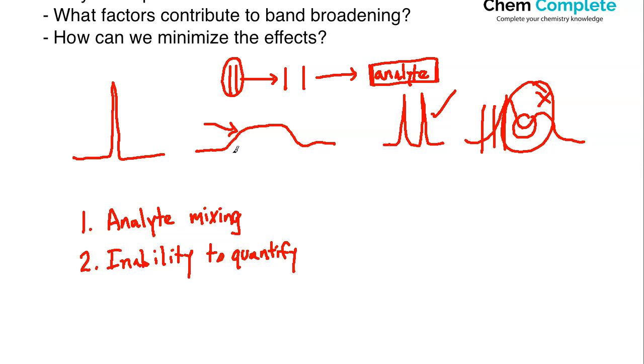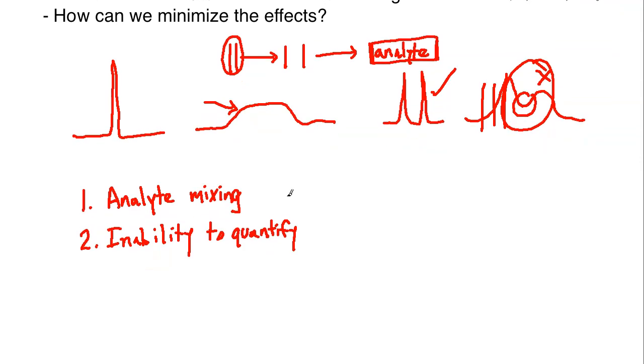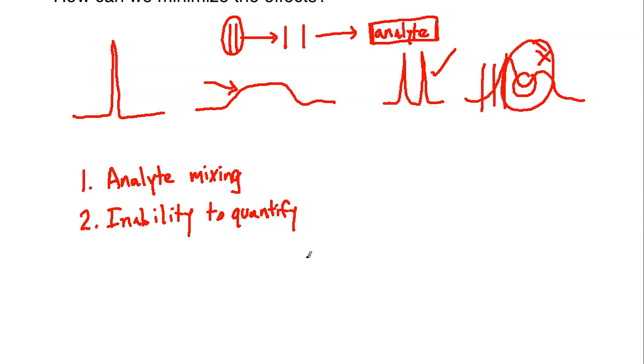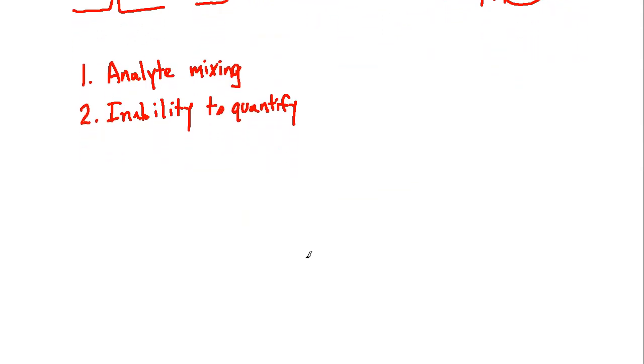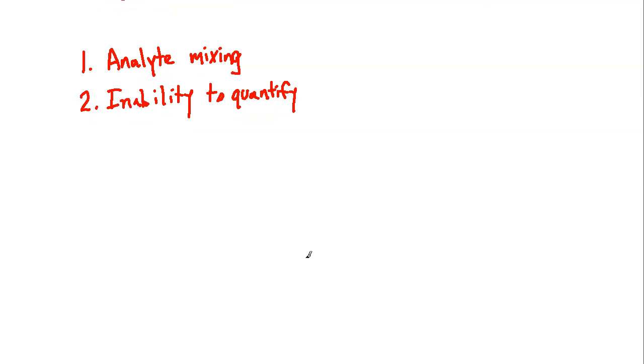And that's a problem, not necessarily so much about purification, but about analysis and quantification, being able to say, hey, this mixture is 22% of this analyte, right? If something is sent in and you're analyzing it based off of standards that you're making and putting into your HPLC system. So those are the two major problems or issues that typically can come across, right?